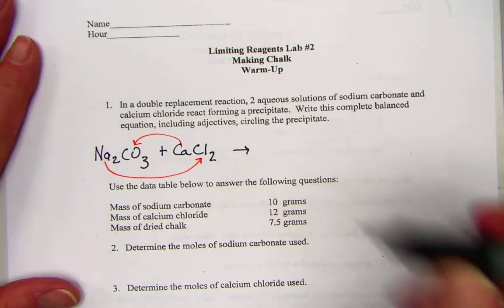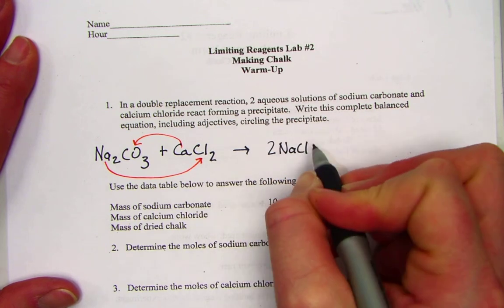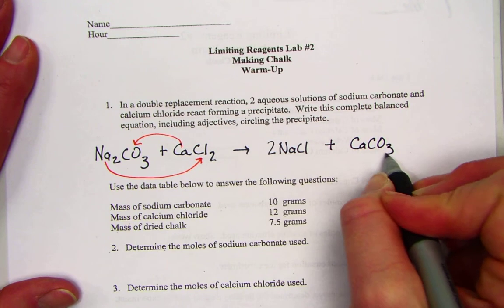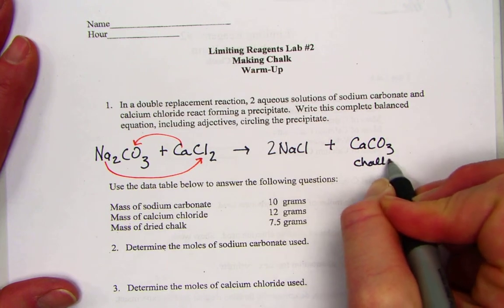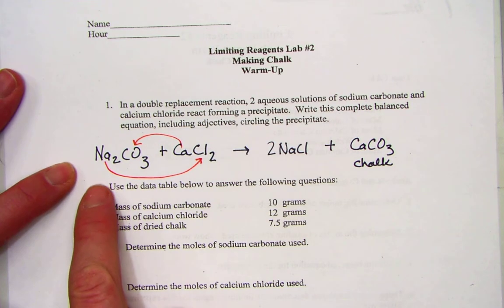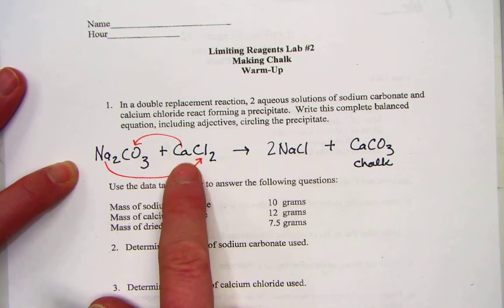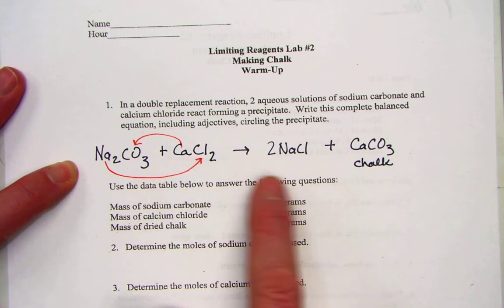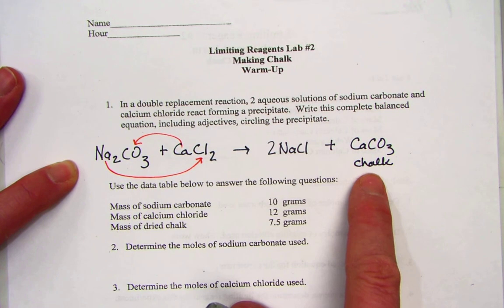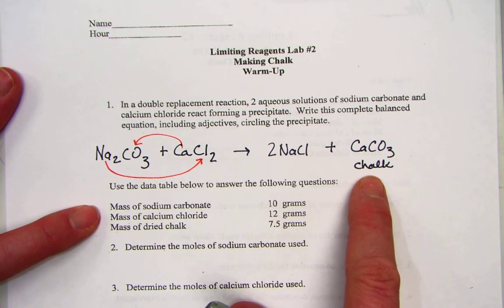And as we predict our product, we would see 2 units of our NaCl, sodium chloride, and 1 unit of our calcium carbonate. And this is what we called our chalk during yesterday's experiment. So here's our balanced equation where 1 mole of our first reactant, sodium carbonate, reacts with 1 mole of calcium chloride, giving us 2 moles of sodium chloride, and calcium carbonate is our solid precipitate. Calcium carbonate is known as chalk.